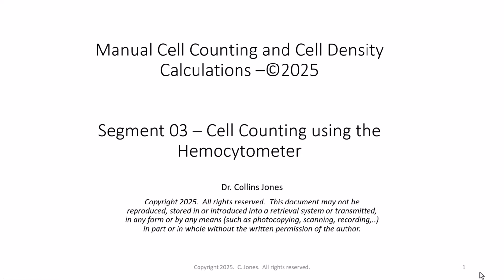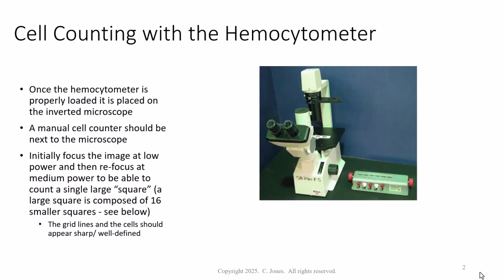Welcome to segment 3 of my video series on manual cell counting and cell density calculations. In this segment, we will cover actual cell counting using the hemocytometer. Let's pick up where we left off in segment 2.